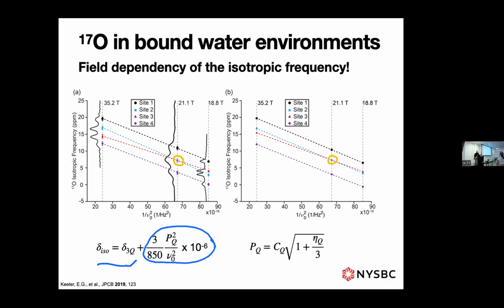So did you know, based on the literature, that the quadrupole coupling would be likely to be the sweet spot, or did you just try that first? Yeah, because it's generally the first place to go. You won't see very much other than 3Q MAS. Triple quantum MQMAS is almost everything that's out there, even if you're working with something that's 5/2.